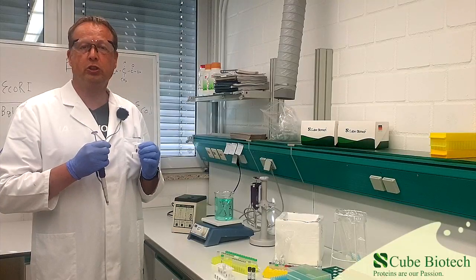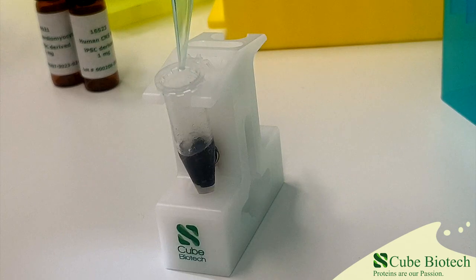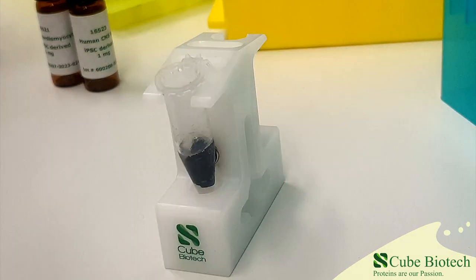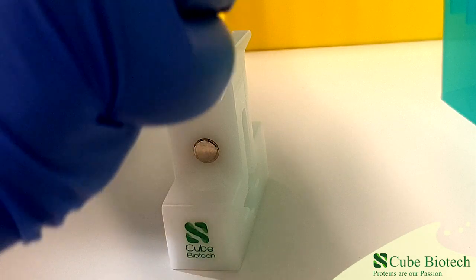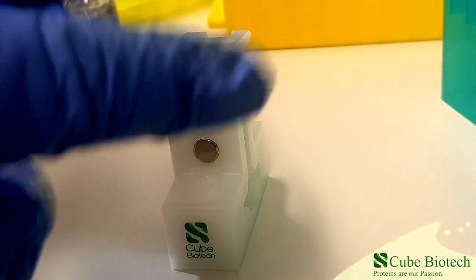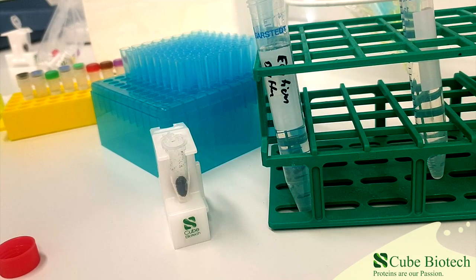Now we just use a normal pipette and remove the supernatant. Afterwards, we wash the MAC beads two times with washing buffer. Removal of the washing buffer is done the same way as the removal of the incubation buffer before. Just add the appropriate amount of elution buffer and mix well.